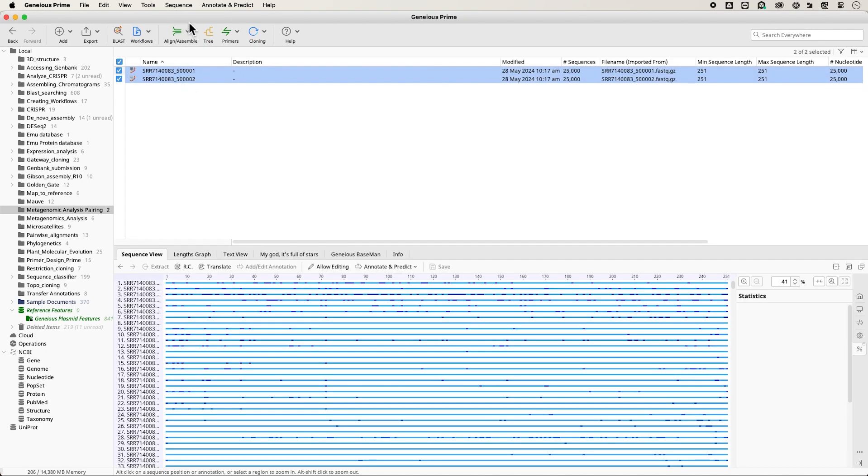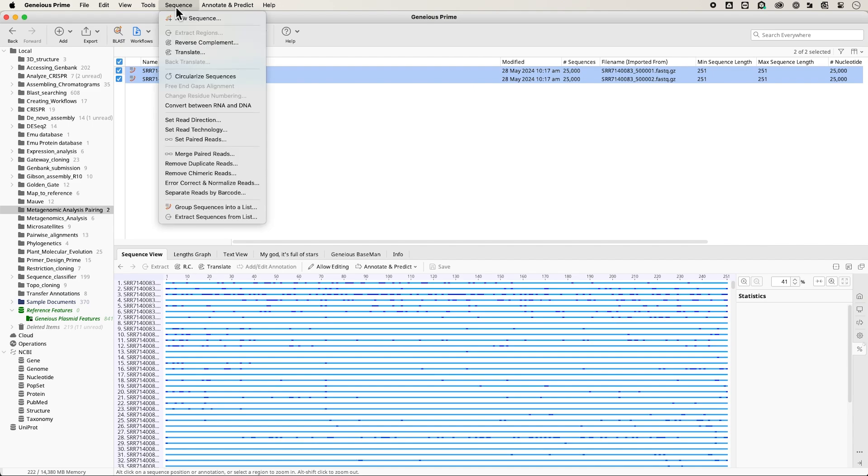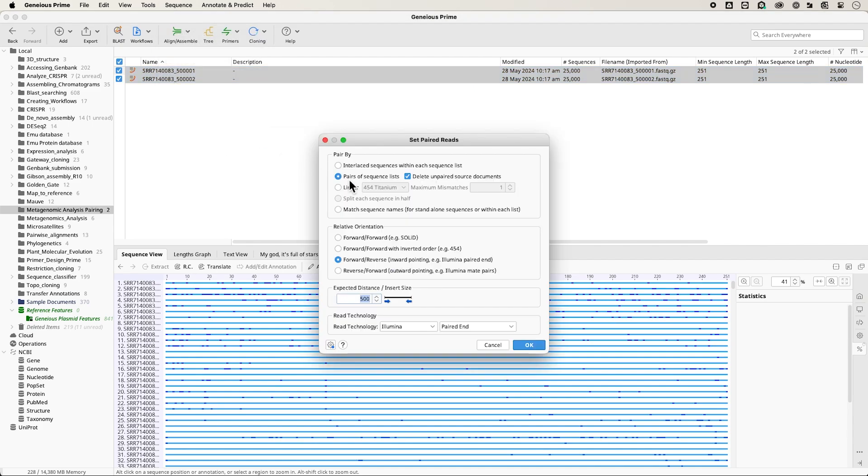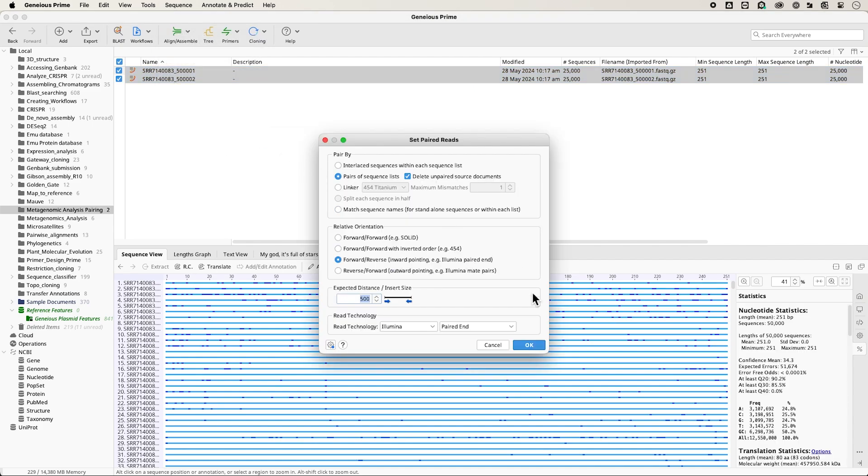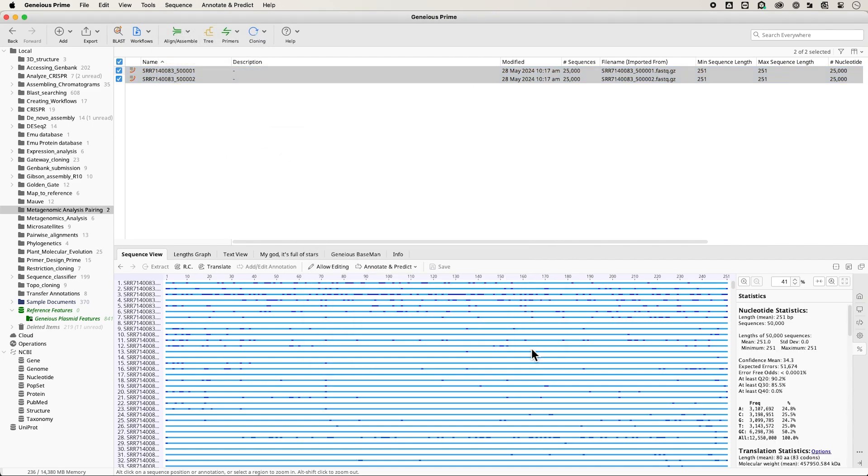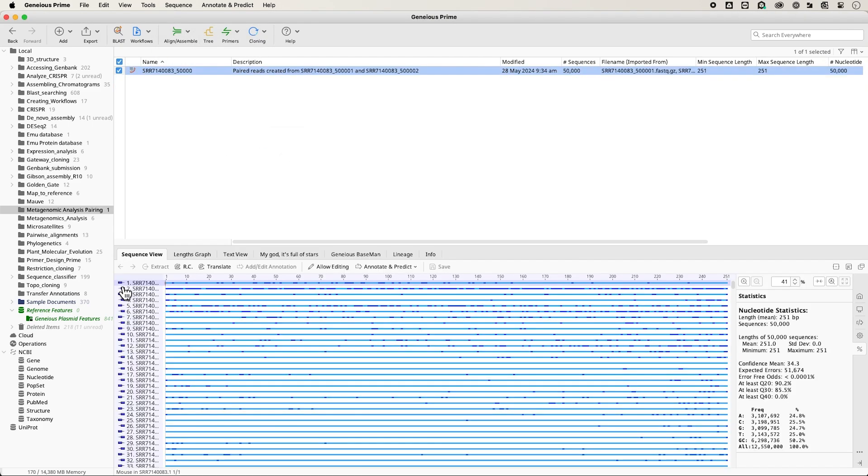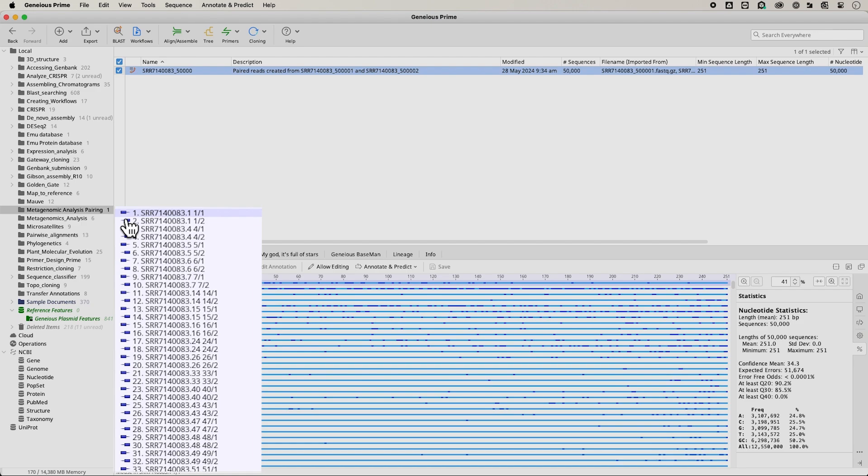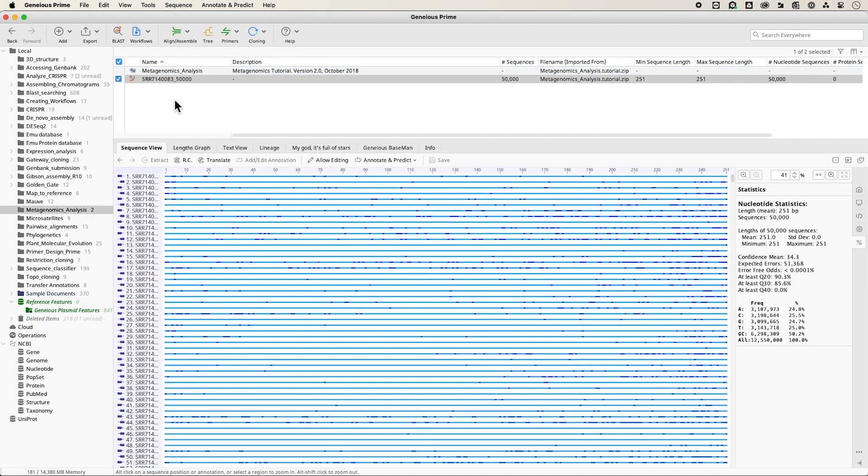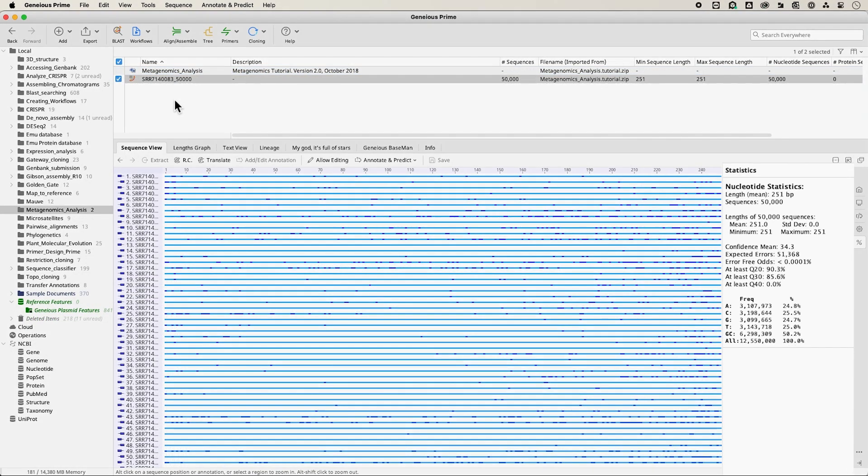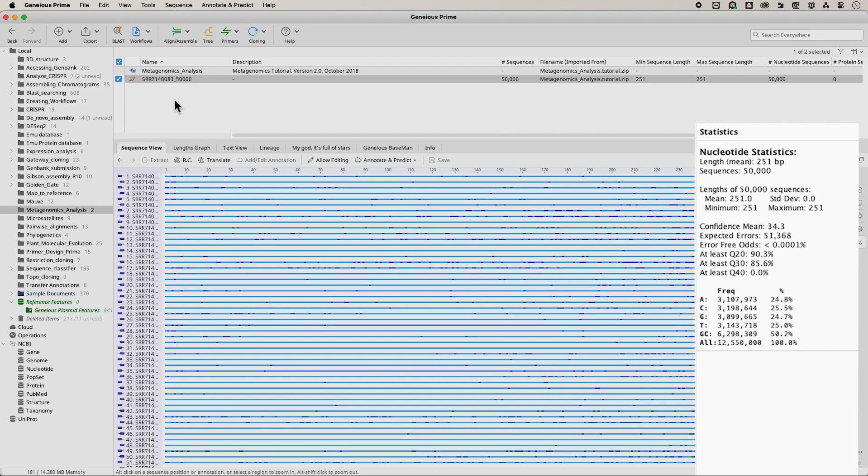Alternatively, you can click Sequence and Set Paired Reads to pair them within Genius. In the sequence view, pairs are indicated by symbols showing the forward and reverse reads. For this example, we will use a subset of 50,000 paired 16S Amplicon reads.